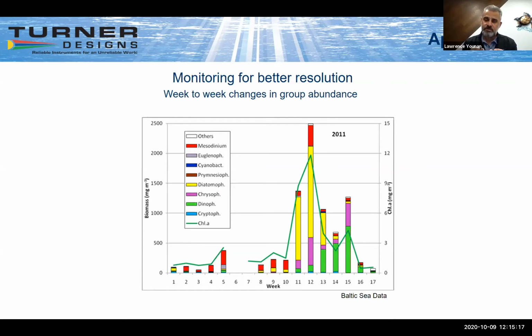These kinds of data can be better resolved and give us a better understanding of what's happening between those times if we were working in the environment versus taking water out of the environment to take it back to the lab. So you got to kind of ask yourself, what's more important? Do I want to understand my system more, or do I want to just take water out and see what's in there? Now, there are both thoughts, and they both could have their pros and cons, of course.